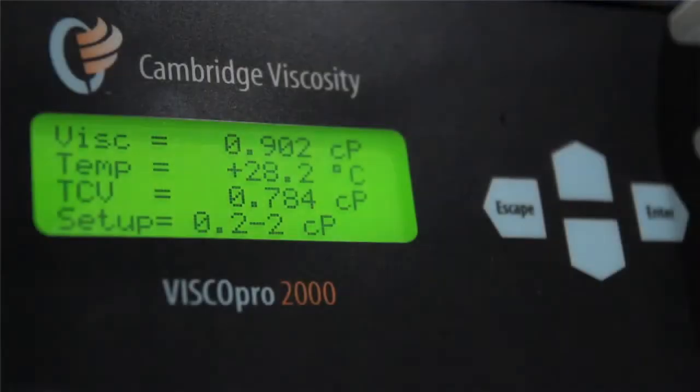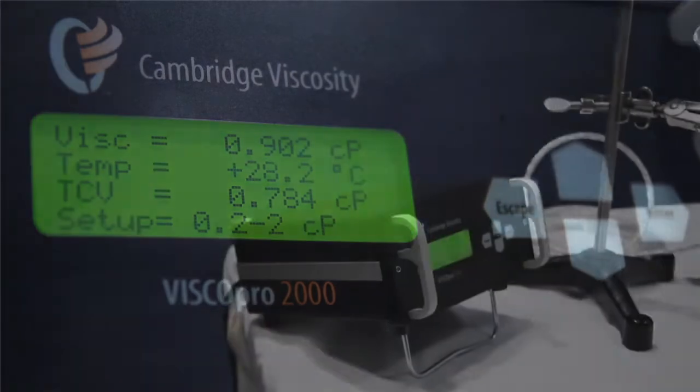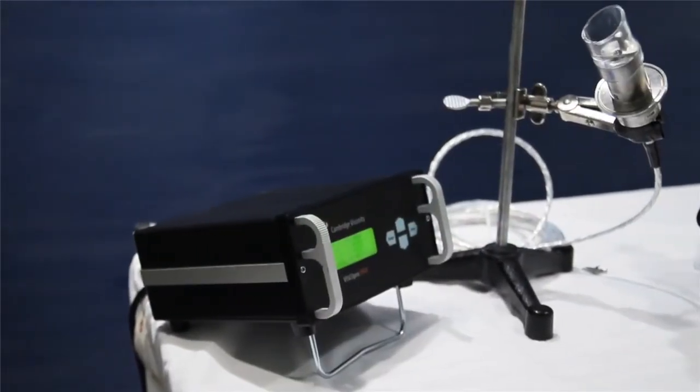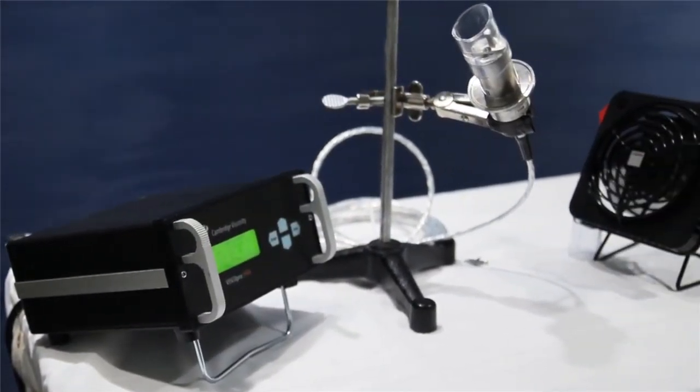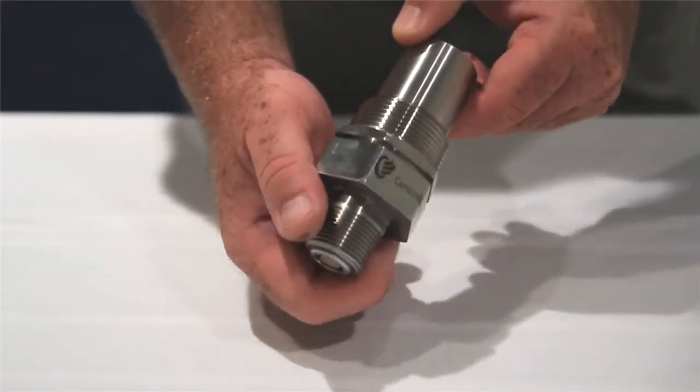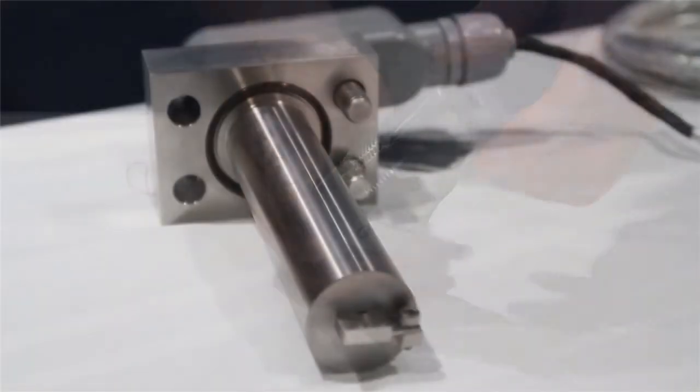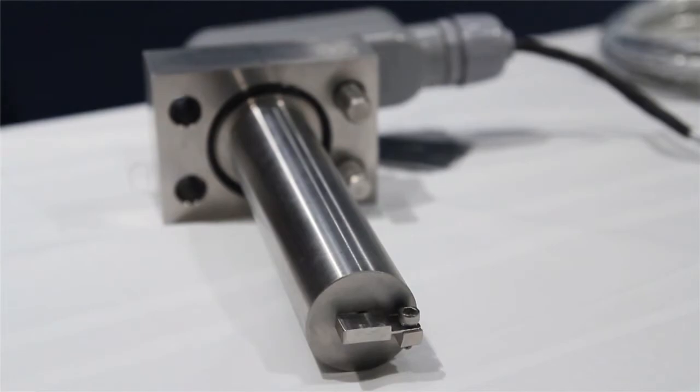You now know how to verify viscosity for a 300 series Cambridge sensor. This will verify that your viscometer is measuring viscosity correctly. This is for the majority of applications using Cambridge Process Sensors. Not all viscometers are the same. Please contact Cambridge Viscosities Service Department with any questions.